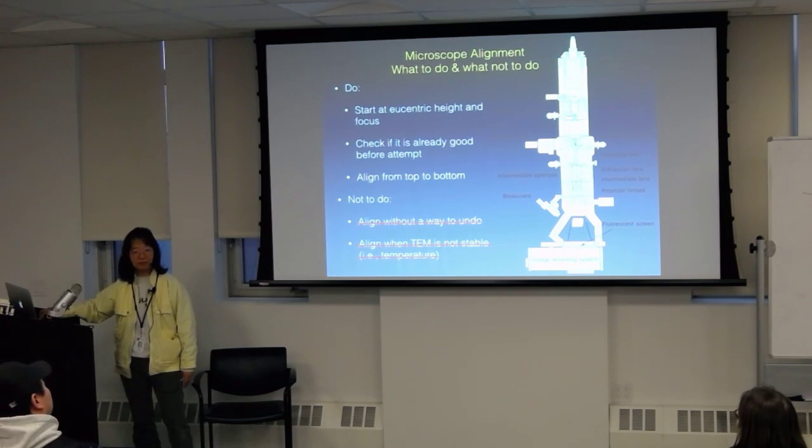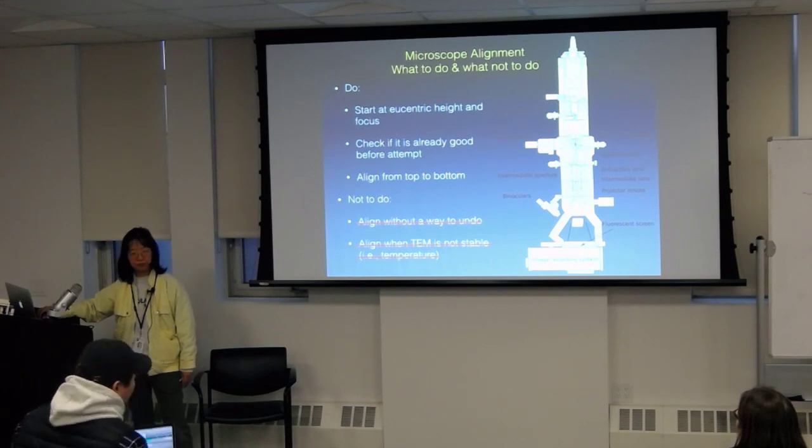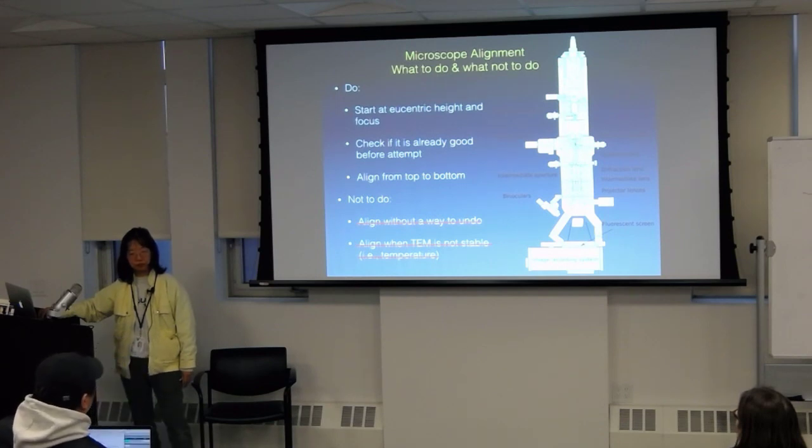What about for a system where it's not cold all the time, like a T12 or an F20, where you cool it down in the morning? How long should you wait before you do alignment on a system like that?